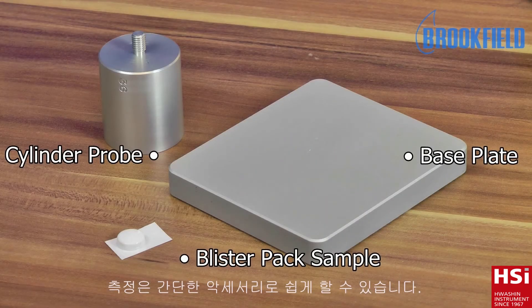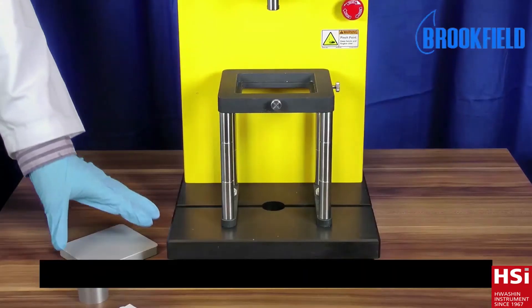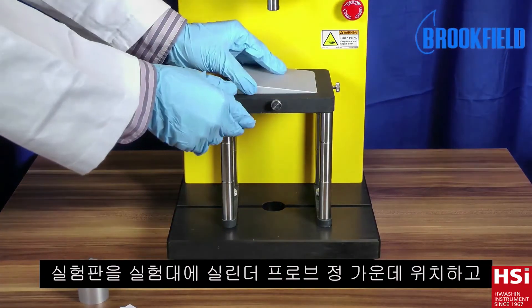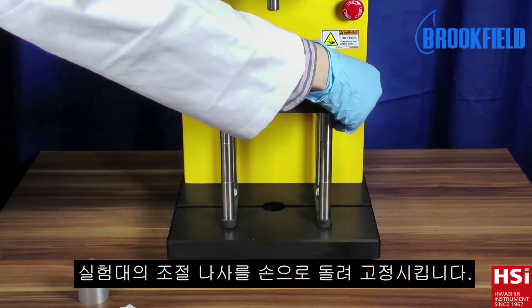Here you see the individual parts of the accessory. To set up the test, place the base plate onto the fixture base table and tighten into position using the thumb screws.